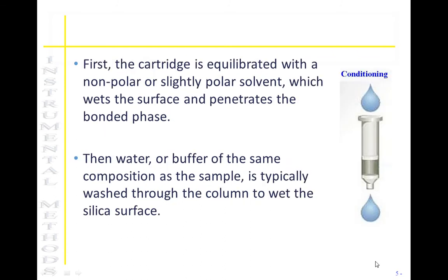When performing the solid phase extraction, there's a cylinder very similar to the one on the slide that contains a slightly small area of solid material, which is going to attract that analyte and trap it. The column itself needs to be conditioned, so usually there's going to be a series of liquids that are passed through the column to wet the material.